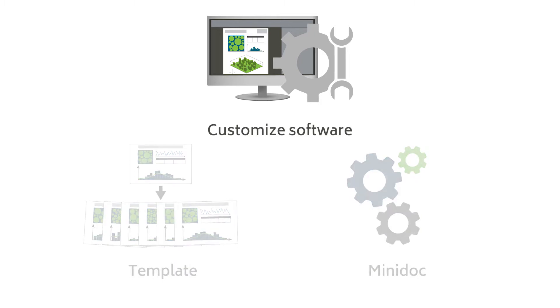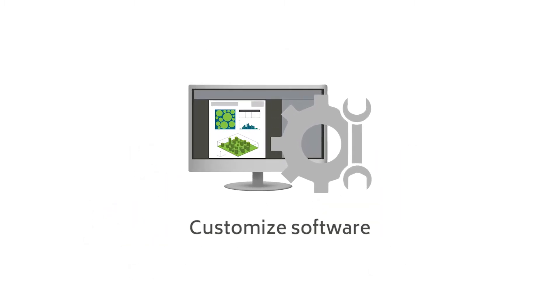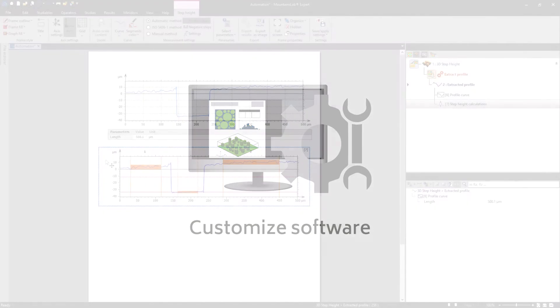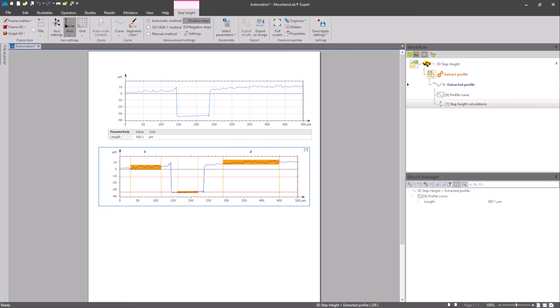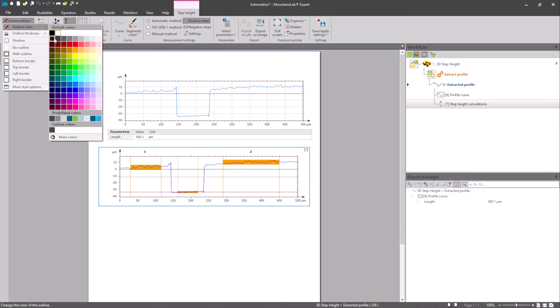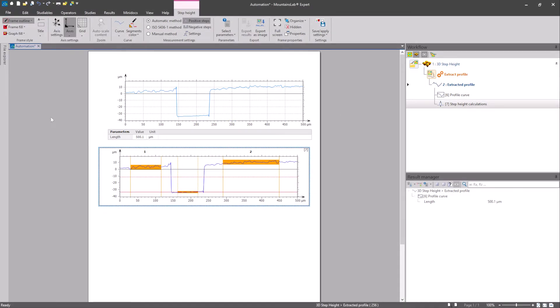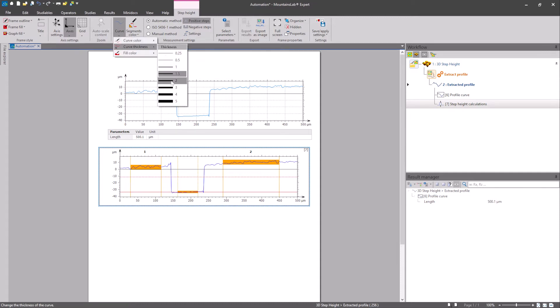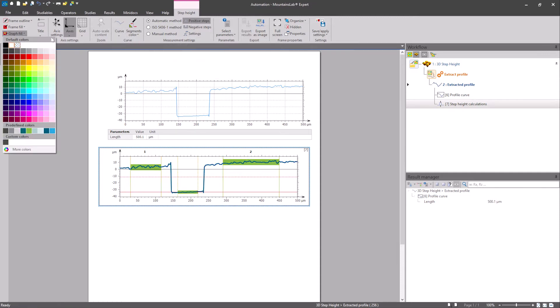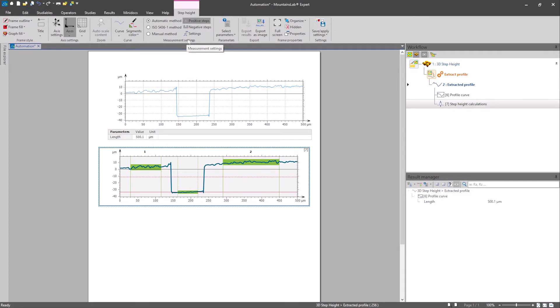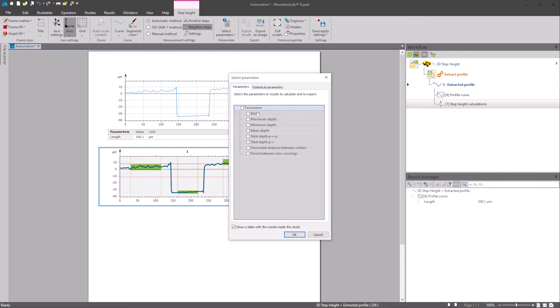First of all, let's focus on customizing your settings. Here in the step height study I'm going to choose to display a border. I'm going to define curve thickness, background color and say I want to analyze negative steps and display minimum depth and mean depth parameters.